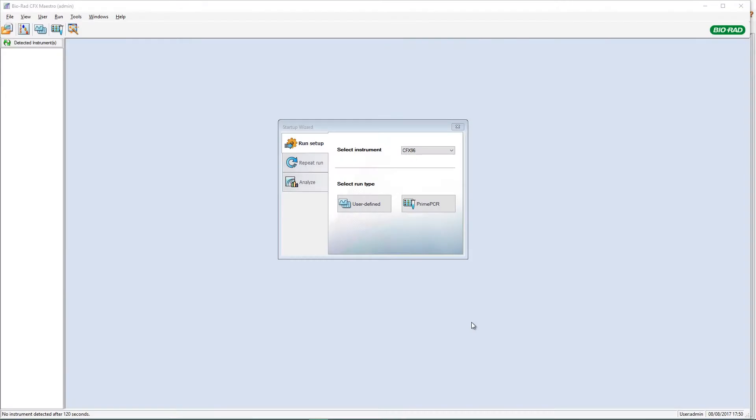In this video, we'll show you how to use the Reference Gene Selection Tool and the PrimePCR Controls Analysis Tool in CFX Maestro's software. Both of these tools can be found in the Gene Study Module in CFX Maestro.